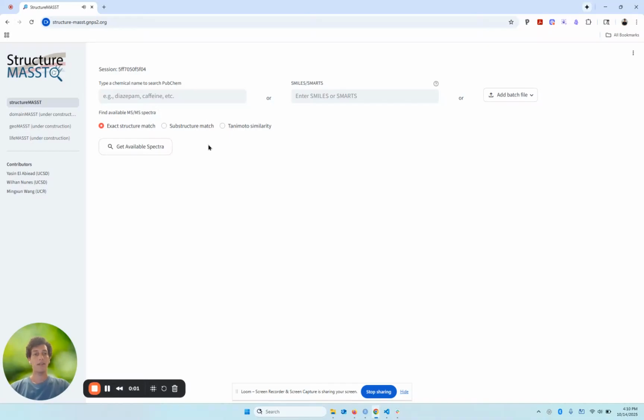Okay, hello and welcome to this quick walkthrough of StructureMASST. If you're watching this tutorial, I'm assuming that you have already seen our video on exact structure search, because here we will only be talking about substructure matching.